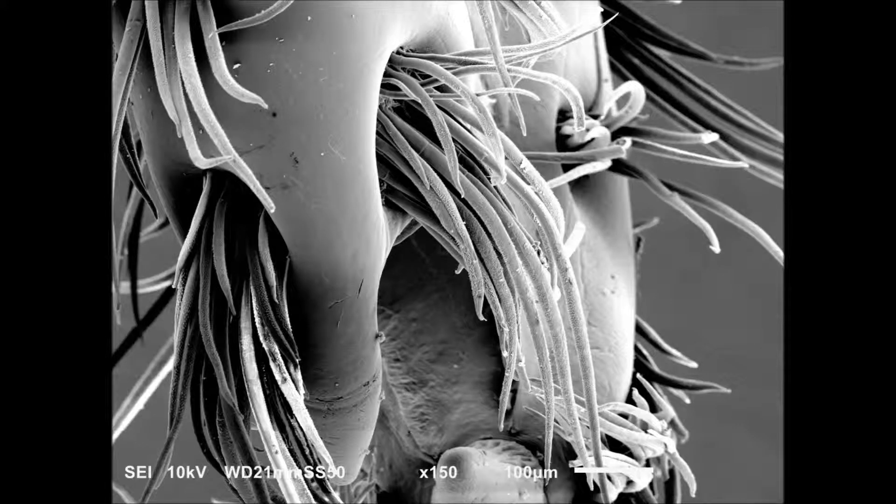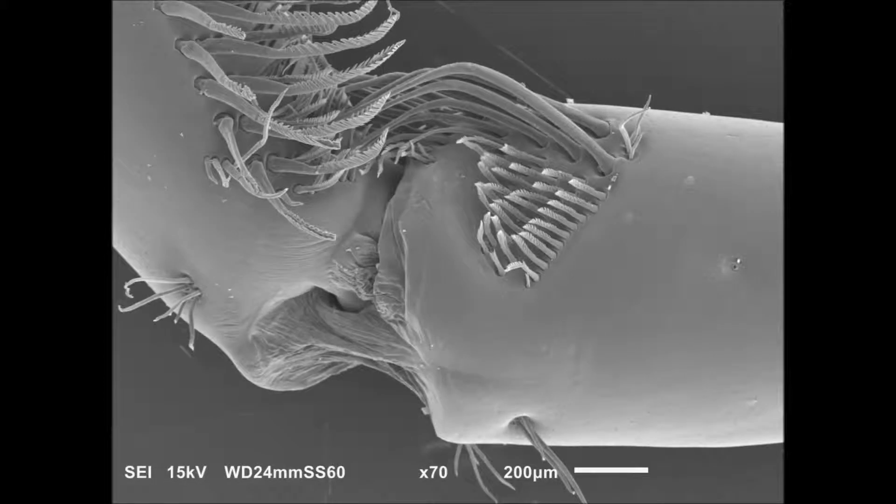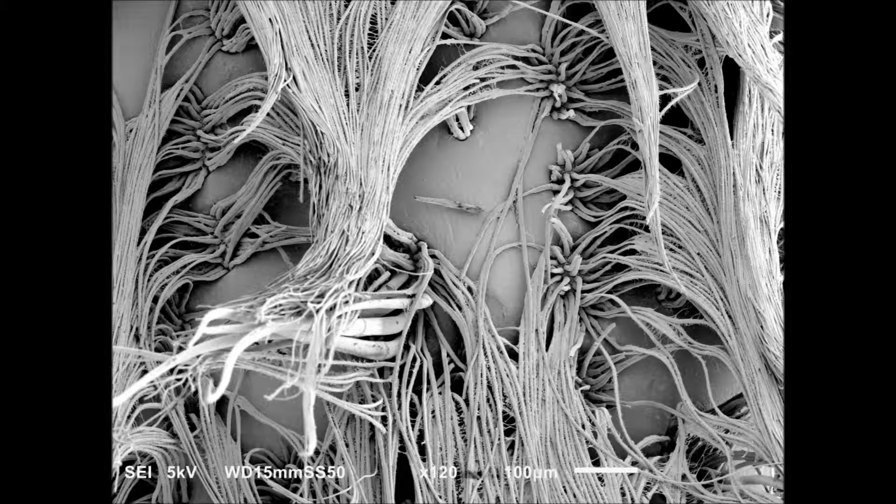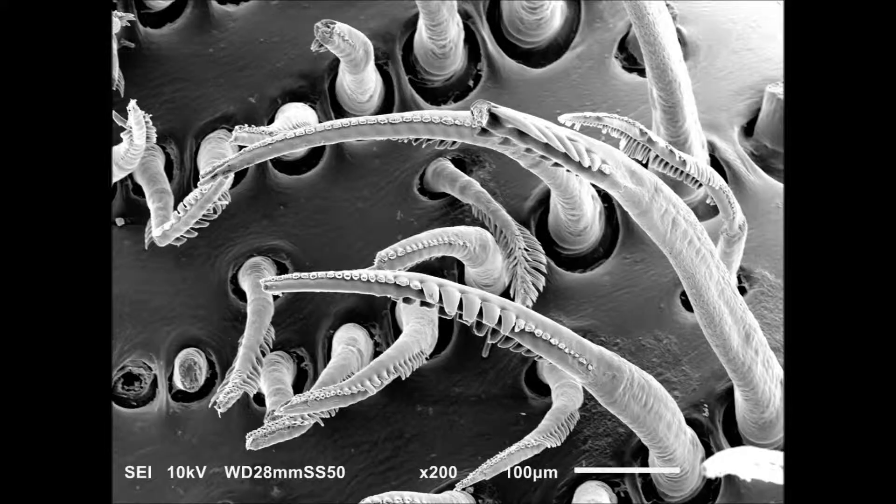The following are images taken from the SEM in the Department of Biology. These are images of the distal end of appendages and the joints of appendages, where you can see many different types of setae. These regions are important for grooming. We can get pretty close up and see some very fine microstructures that help these individuals groom. Sometimes the structures may look like a mass of hair or they may look like bristles of a hairbrush.